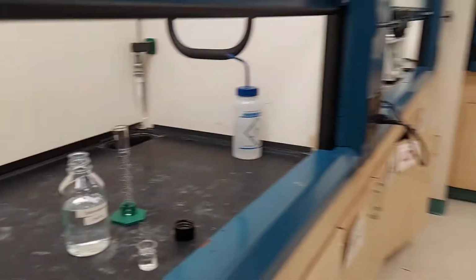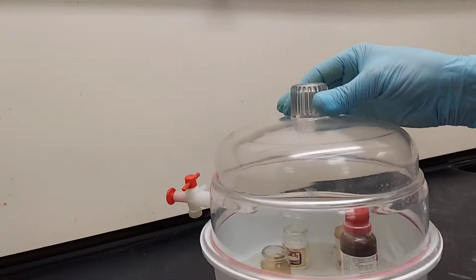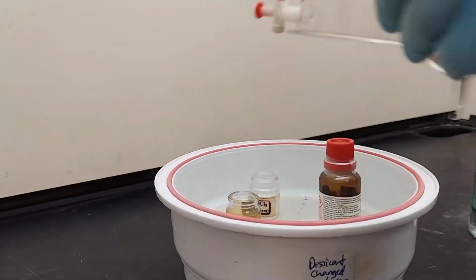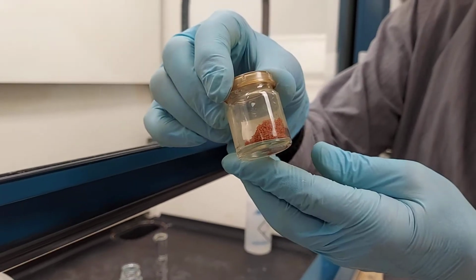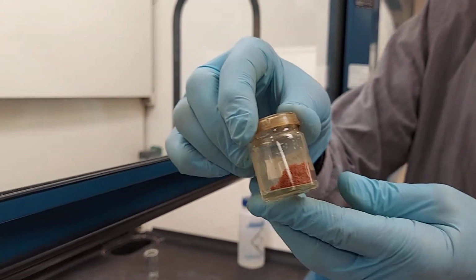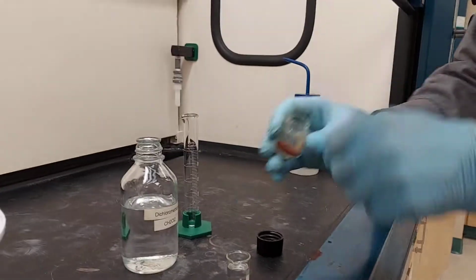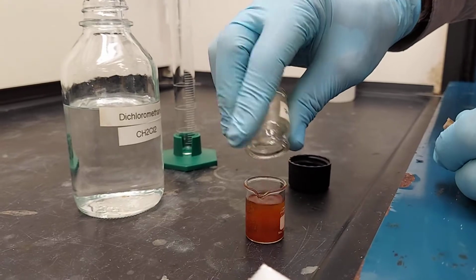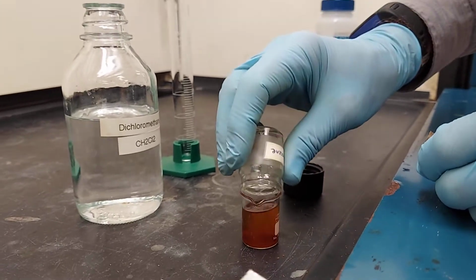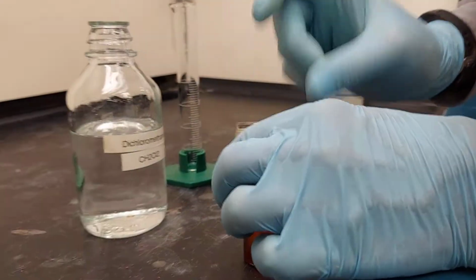And how much ferrocene is going to go in there? 0.9 grams of ferrocene. The ferrocene we have pre-measured here, and notice it is a rust-colored substance. We should not be surprised by that. And we're going to put it in our 9 mLs of dichloromethane solvent, and try to get all of it.